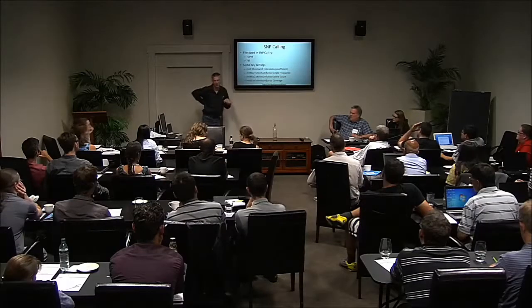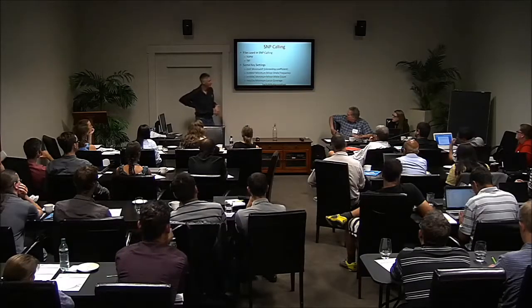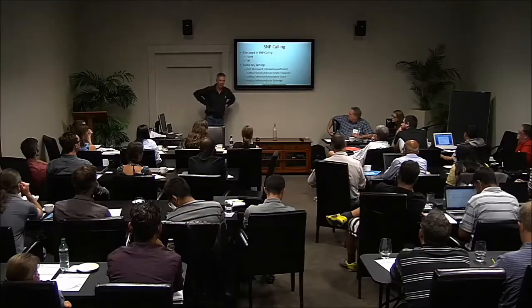They're very similar. Yeah, but these two work together, right? Those two work together, and you have to pass one or the other. So I often set the minimum minor allele count, at a really high level that you can't attain, so that the minor allele frequency is controlling everything. And then there's a minimum locus coverage. That's sort of how many individuals have been hit by at least one of the tags. So once you're calling SNPs, you're using the set of tags that align to the same start position. I call that a tag locus. And locus coverage is how many individuals, how many taxa have been hit by at least one of those tags in that locus. Yes.